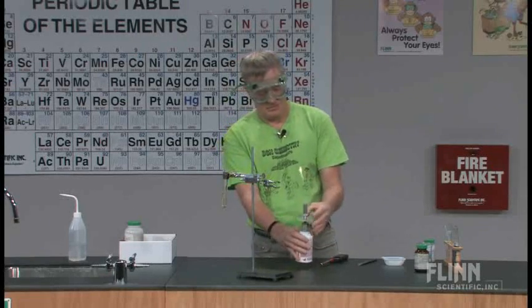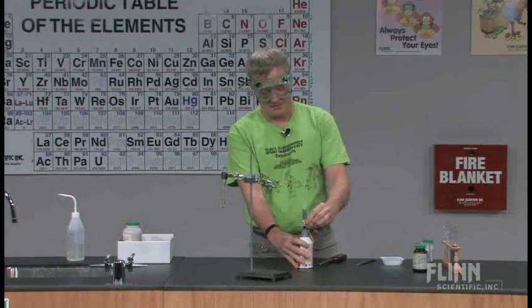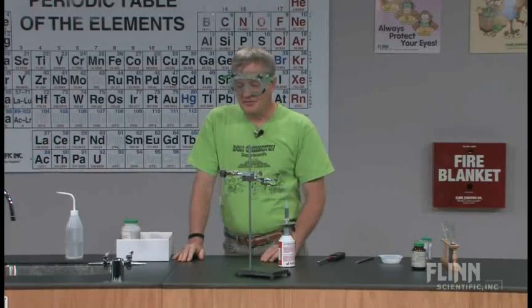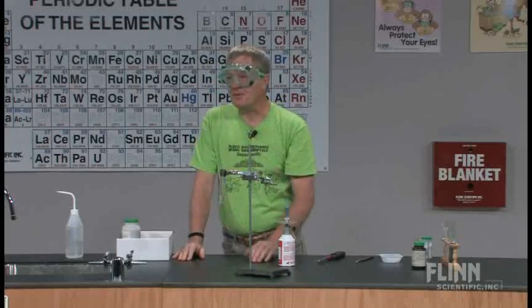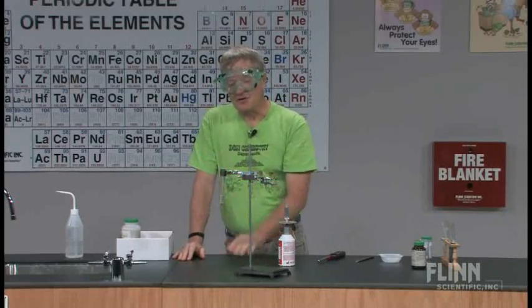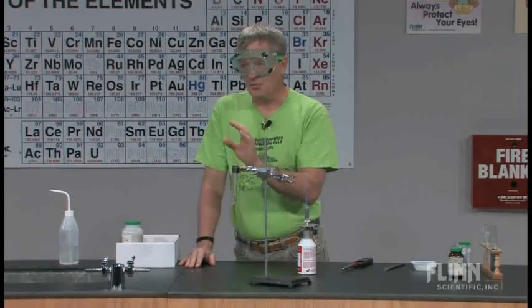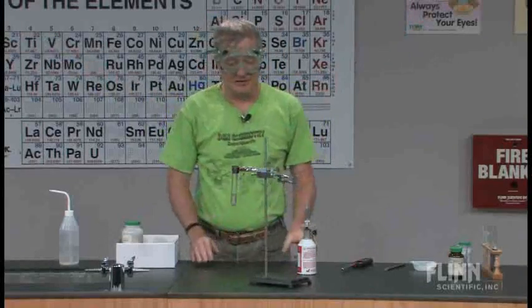Right here is something that you want to kind of keep in mind as far as safety is concerned. Test tube tilted a little bit on an angle. Probably don't want it straight up and down. I always tell my students, don't point the test tube when you're heating it with a liquid in it at your lab partner. Don't point it at yourself. That's really stupid. If you put it vertically, it'll shoot up and get everybody. It's kind of an umbrella effect.